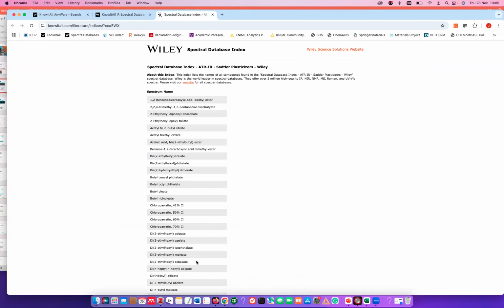Why am I showing you that? Because sometimes it happens that you're searching for your compound of interest with KnowItAll AnyWare, and it looks like it's not there in the database, but you'd expect it to be. And in such a case, I go here and I check if I can find it in one of those lists. So that's the reason why I'm showing you that.